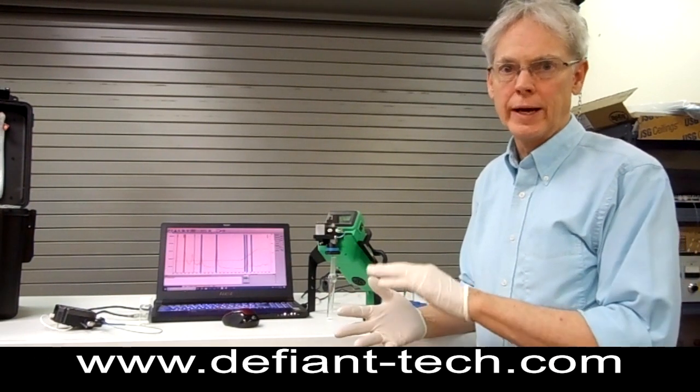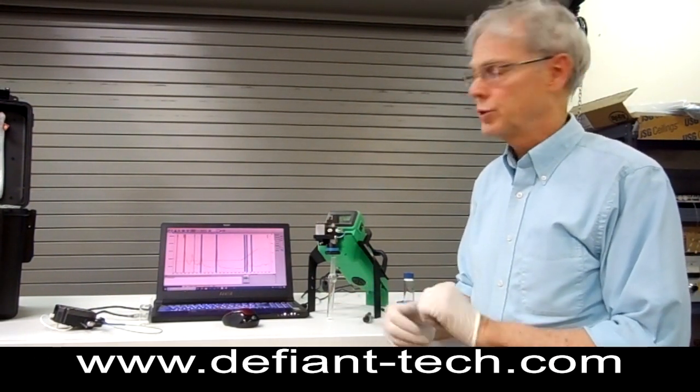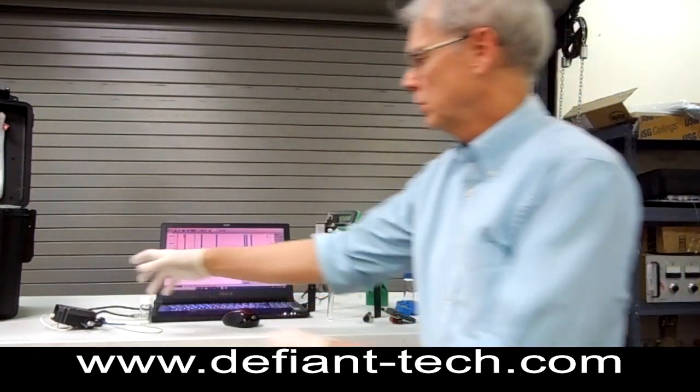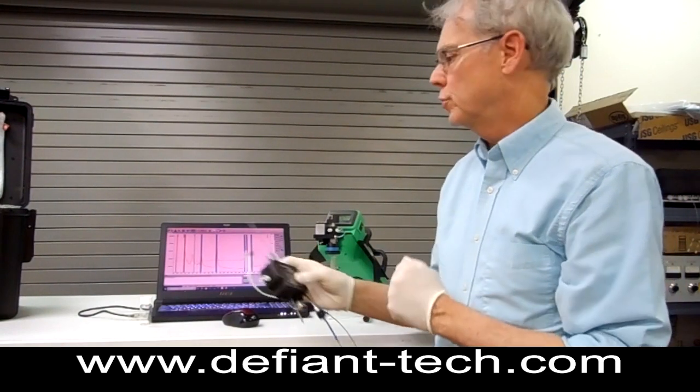things like volatile organic compounds that you may find in air, water or soil samples. To do air testing, there's an adapter that goes on the front of this that allows you to pull air samples in directly.